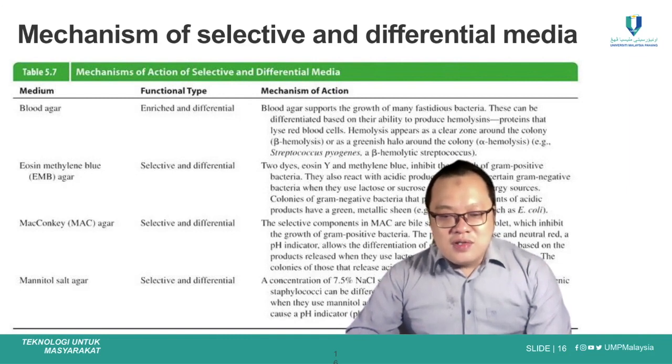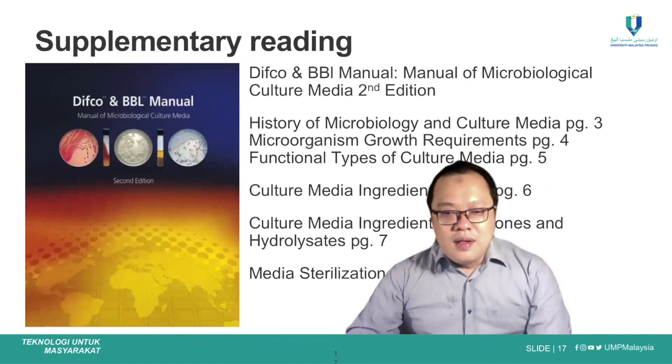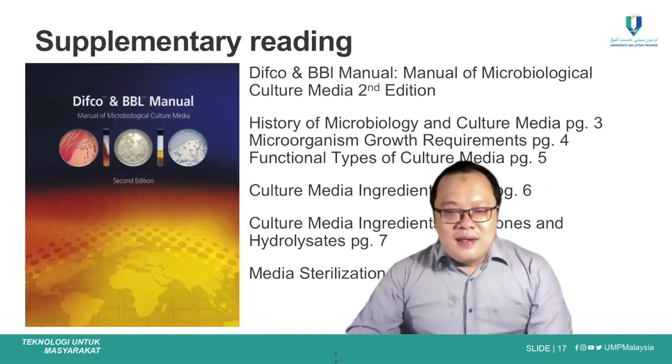So this can be useful to isolate staphylococci in this type of agar. To read more about the type of culture media and the requirement of the functional growth, I suggest you read the DIFCO and BBL Manual, Manual of Microbiological Culture Media, second edition.